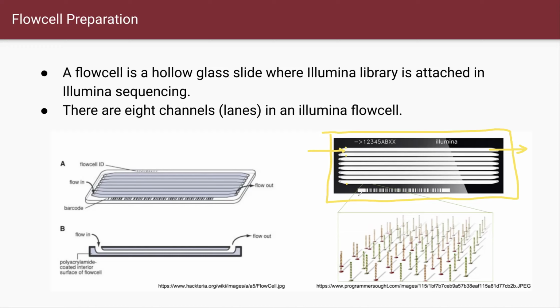And also one more thing you have to keep in mind, not for the exam, but just for your career. The flow cell has a barcode, right? Because barcodes record where these kits are from, where these experiments were done, and who did that. And also which batch this data is used for, right? So all of that information is recorded by this barcode automatically. And this is efficiently managed by the laboratory management system. We call it LIMS or LMS, whatever.